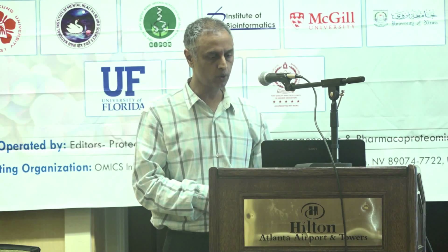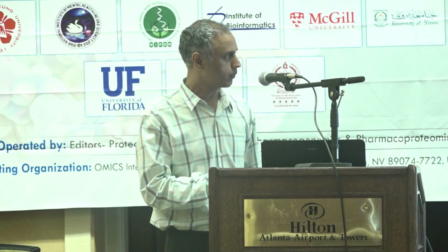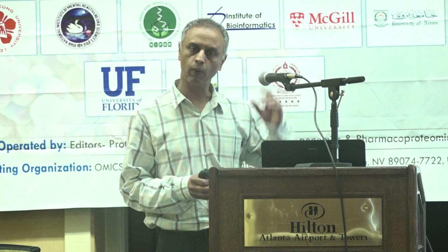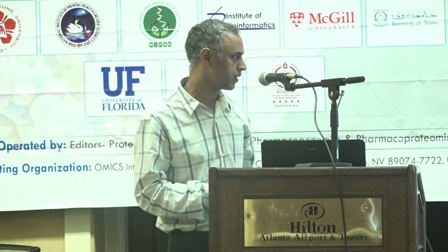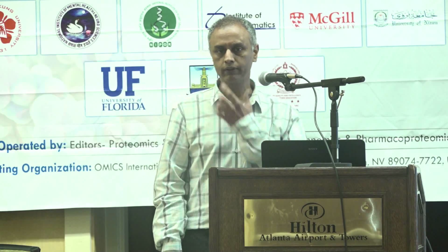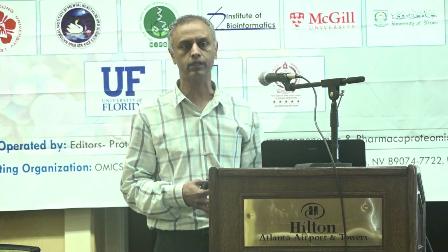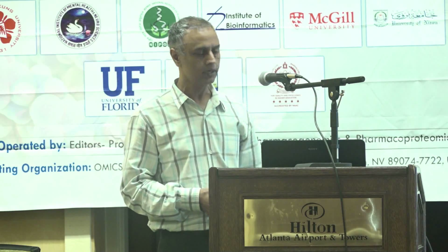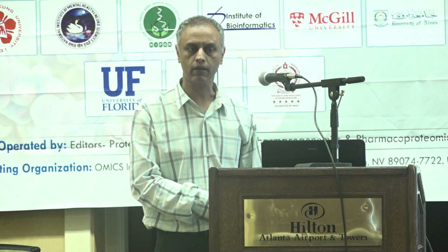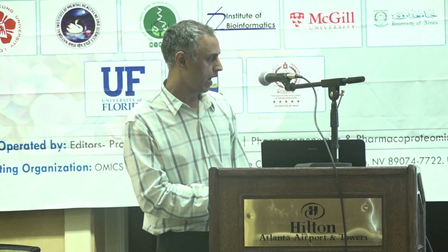So this is using a proteomic approach. One could imagine that the definitive answer lies at the level of the genome. So we have also done whole genome sequencing, where we have multiplexed all of these samples into one lane of a MiSeq next-gen sequencer. So it's a small sequencer, and these genomes are 1,000 times smaller than human genomes. So it's a trivial problem even at the next-gen sequencing level. We are sequencing 10 genomes at the same time and getting anywhere from 50 to 90x coverage of every base pair in the genome. And I will come back to this.